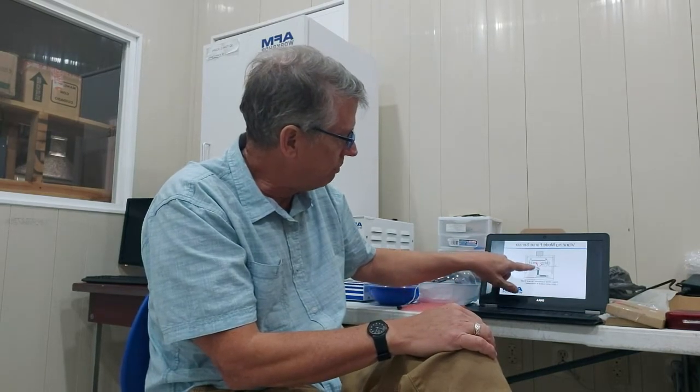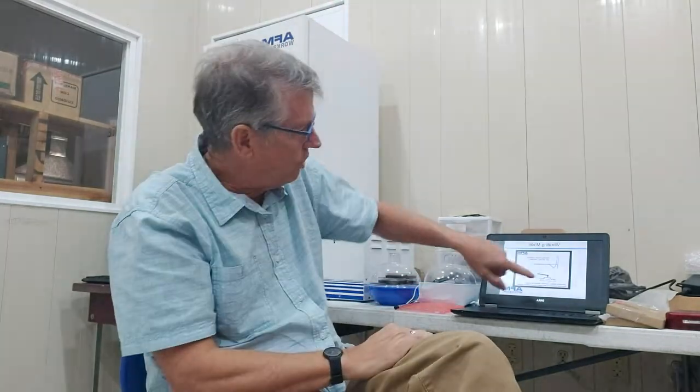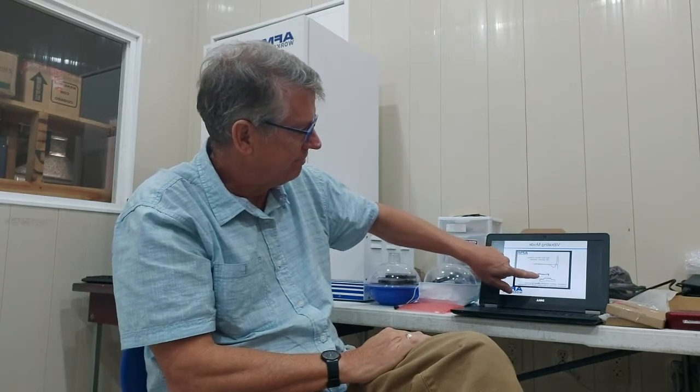Okay, so that's called vibrating mode. What happens is we put this in the microscope, and if the cantilever goes up and down, the light goes across the photodetector, and you get the vibrating output. Okay, and then you can feed that into an amplitude detector. And an amplitude detector measures the amplitude. Now, if you bring a vibrating probe down to a surface, as it begins to interact with the surface, the vibration amplitude is dampened, okay? And if you compare the drive signal to the output of the photodetector with an amplitude demodulator, you'll see that as the needle goes into the surface, it's closer and closer, the vibration amplitude will go down. Okay, and that's shown right here. See the red dots? See the cantilever's amplitude. This is no surprise, right? Okay.